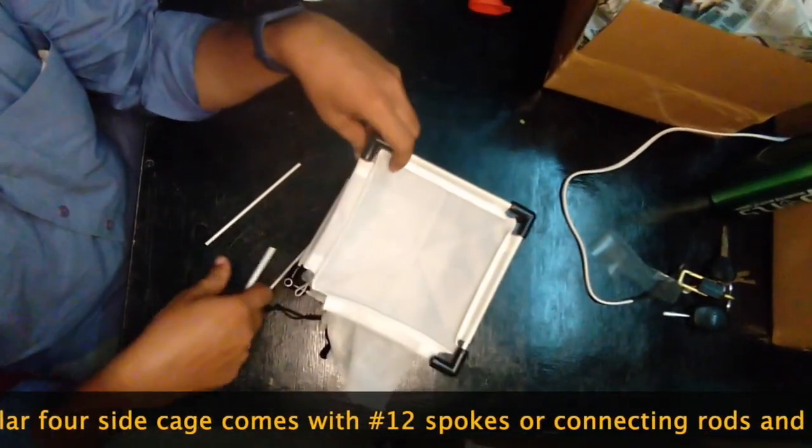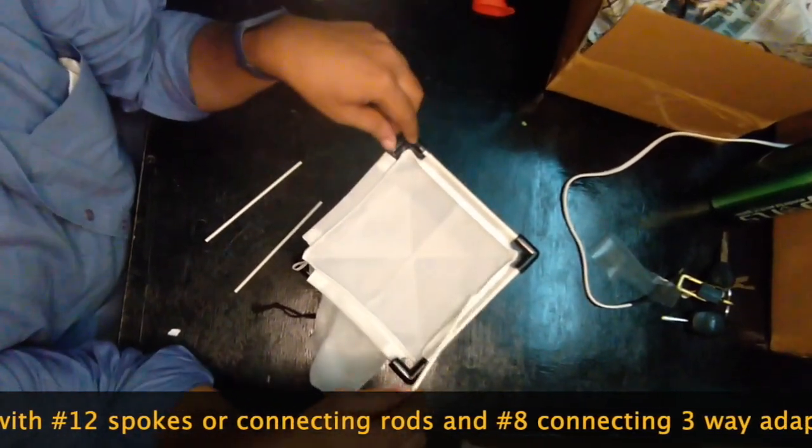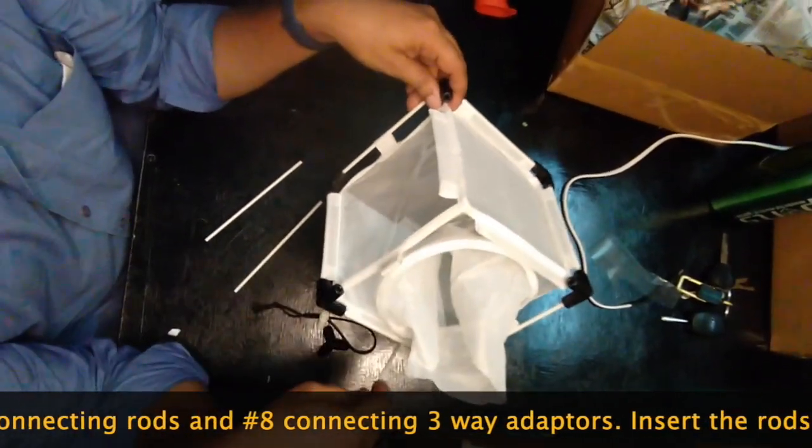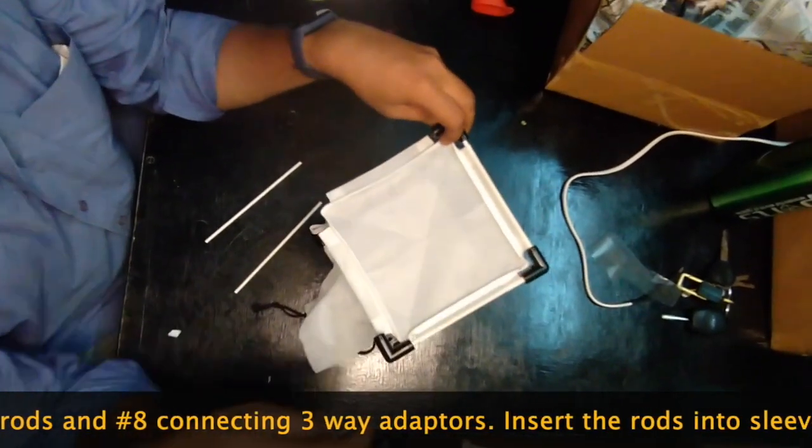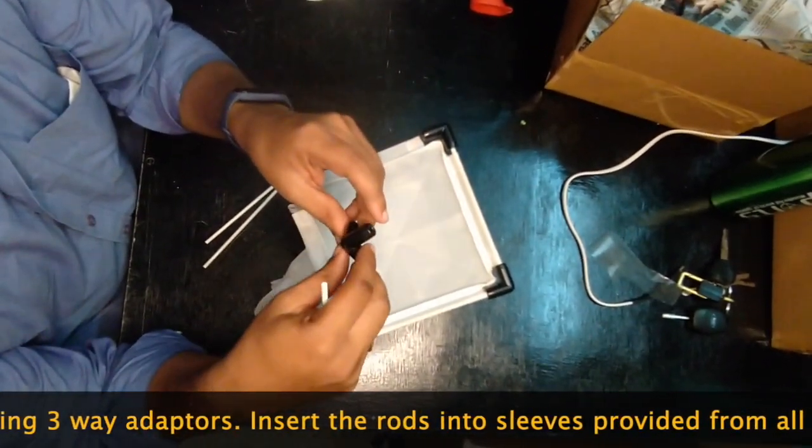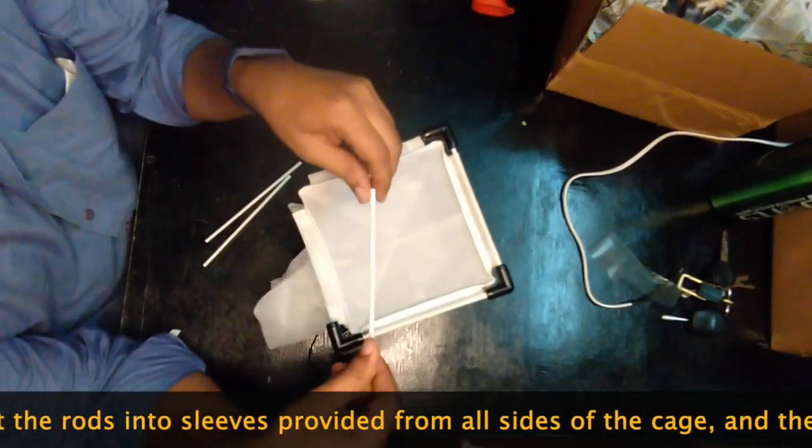You will receive 12 spokes. These are the FRP rods: one, two, three, four, and then four, and then four. Four times three equals twelve. So the cage has black adapters and then 12 FRP spokes.